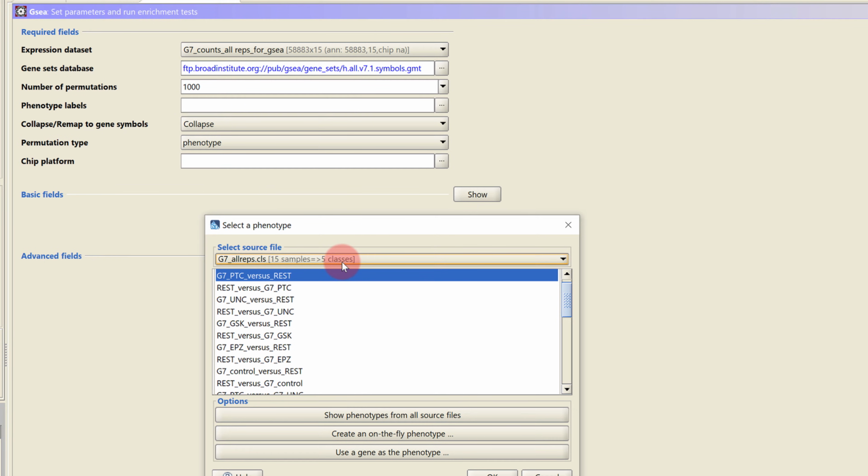And what the software is asking me to do is say, well, within those 5 groups, which 2 do you want to compare to each other? And quite usefully, it will let you choose one of them compared to all the others. So where it says rest here, it's saying, well, this is one sample and it's going to combine all the others into a group. So you can compare one group with all the rest of them.